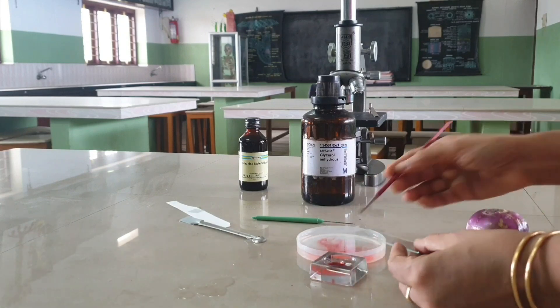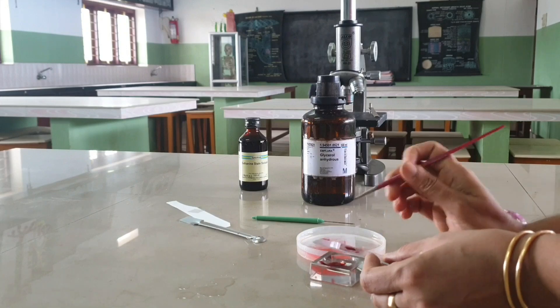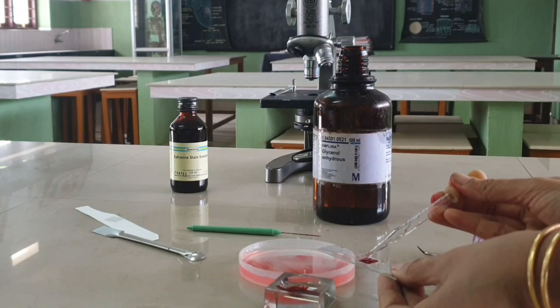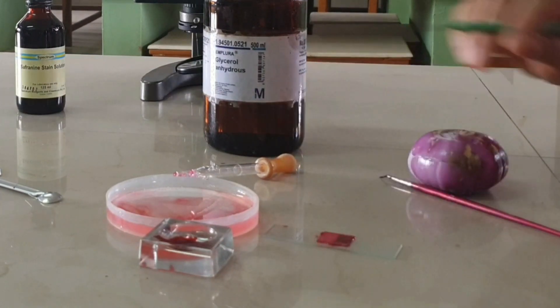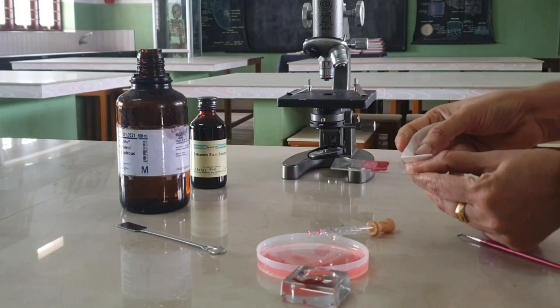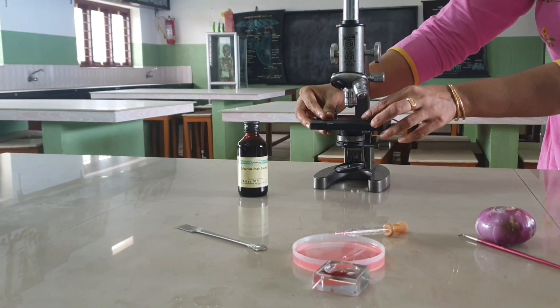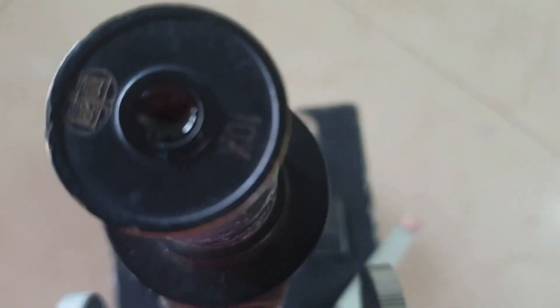Now transfer the peel on a clean slide with the help of a brush. Add a drop of glycerin on the slide, cover the peel and put the coverslip gently. Care must be taken to avoid the entry of air bubbles and the mounting should be done in the centre of the slide. Remove the excess of water or stain, if any, from the slide surrounding the peel with the help of a blotting paper. After putting the coverslip, press it a bit with a needle to spread the glycerin over the peel properly. Examine the slide under the microscope.